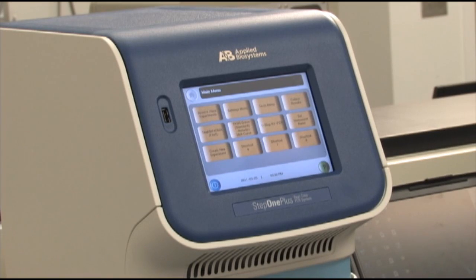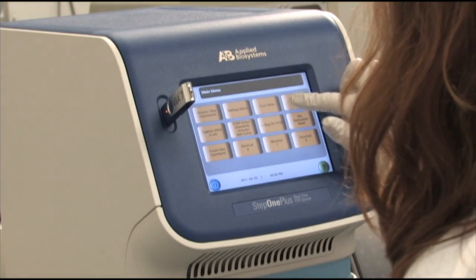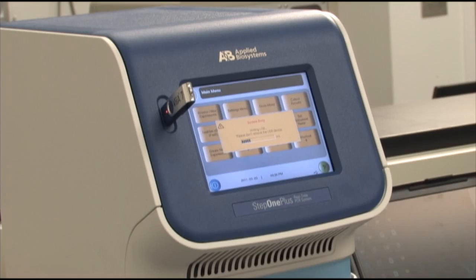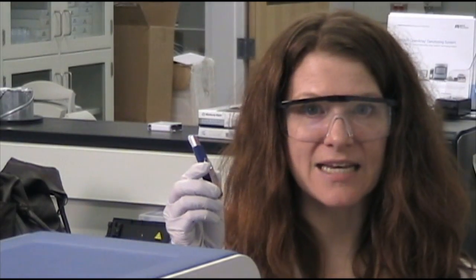Now that the run is completed on the StepOne+, I'm going to collect results by putting in my USB drive and hitting the Collect Results button. The system is busy — it's writing the USB. Please don't remove the USB device. You can see as the data is being written, we have the little bars coming across the screen. Now my experiment's ready. I may remove my USB storage. I just hit OK. My data is on here.